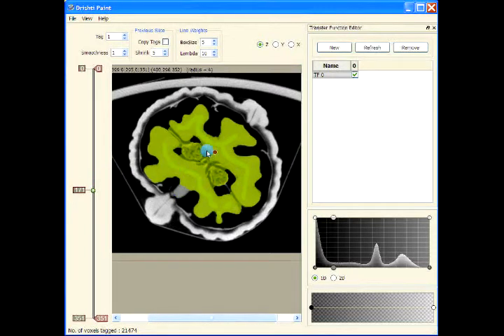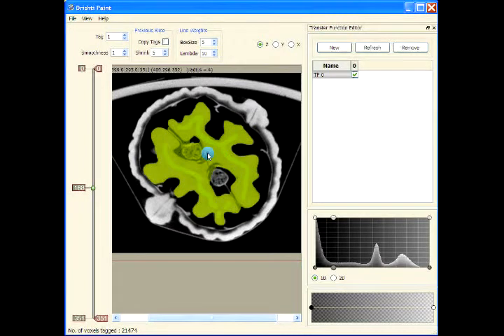Even in the previous one we had tagged this, so press reset. Even here we had some tag, press reset, press reset, press R, reset, and so on. So T to tag. I don't want it to tag here. Press reset.